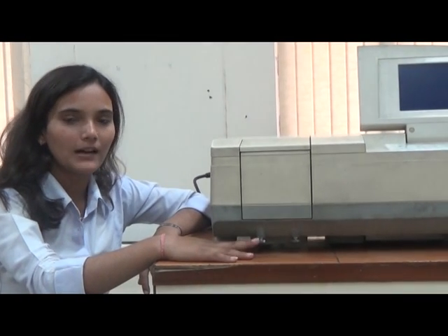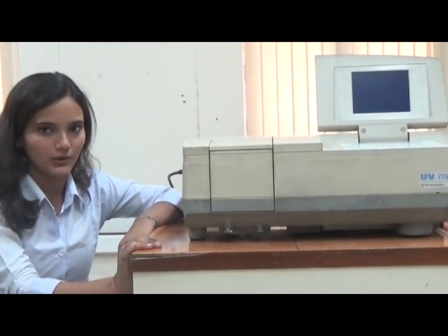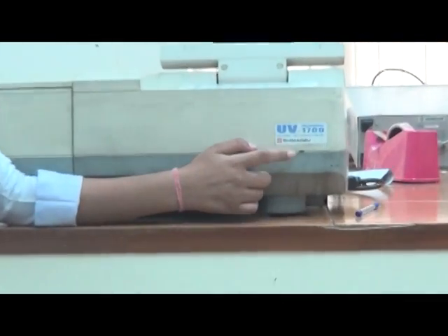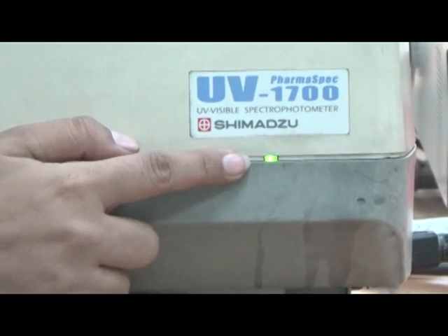These are called sample compartment set screws. These screws are used for fastening the sample compartment units. This is called the LED. When power is off, it looks like this, and when power is on, it glows.